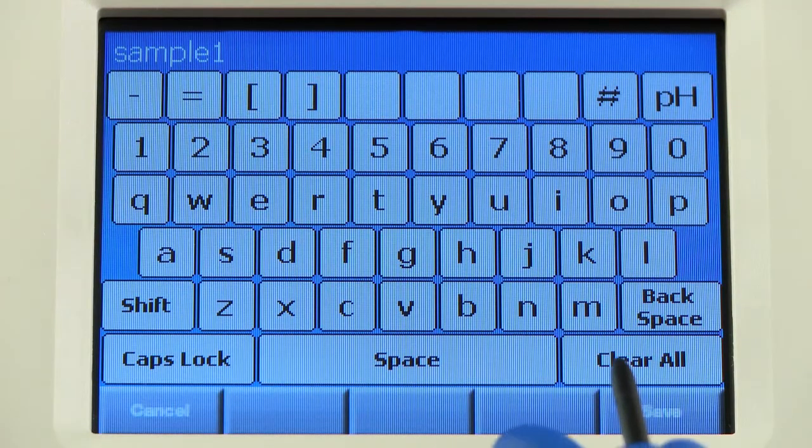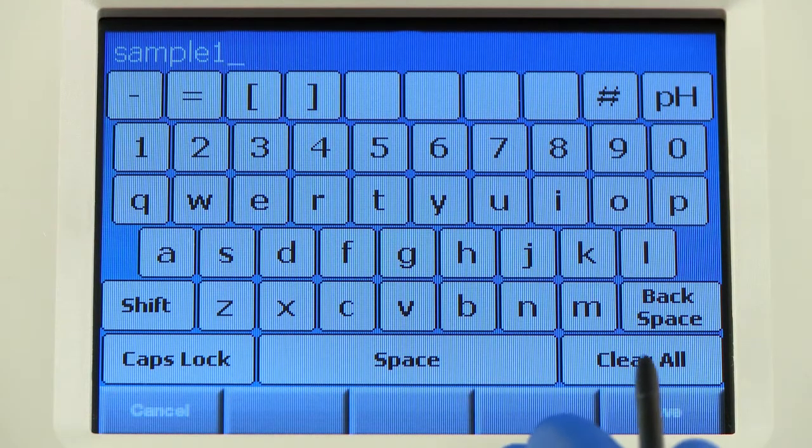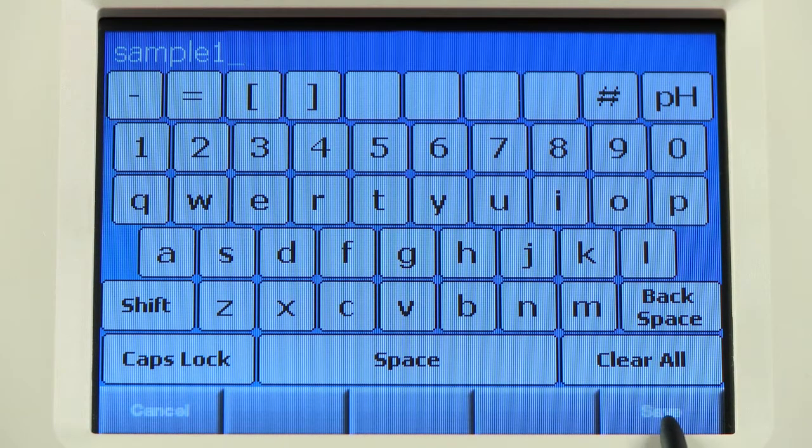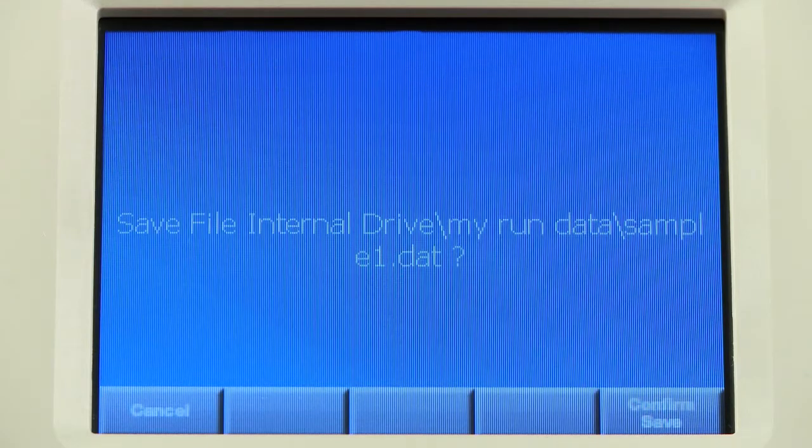The keypad appears and gives you the option to save the name as it is or to change it.